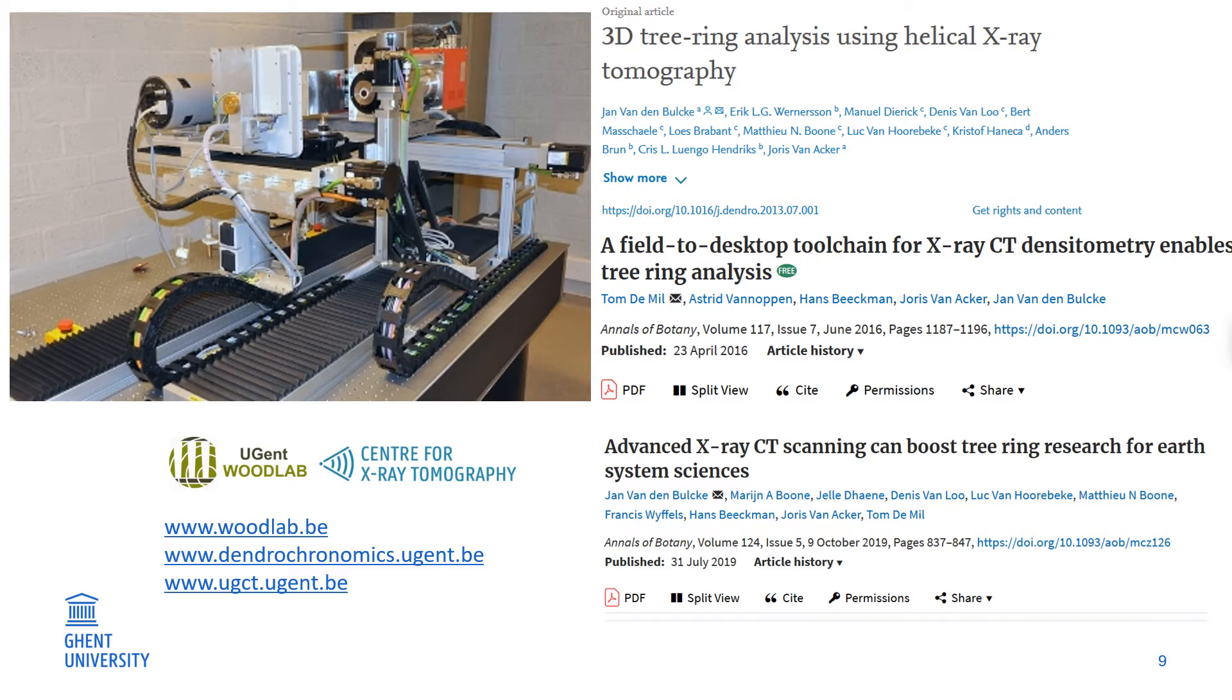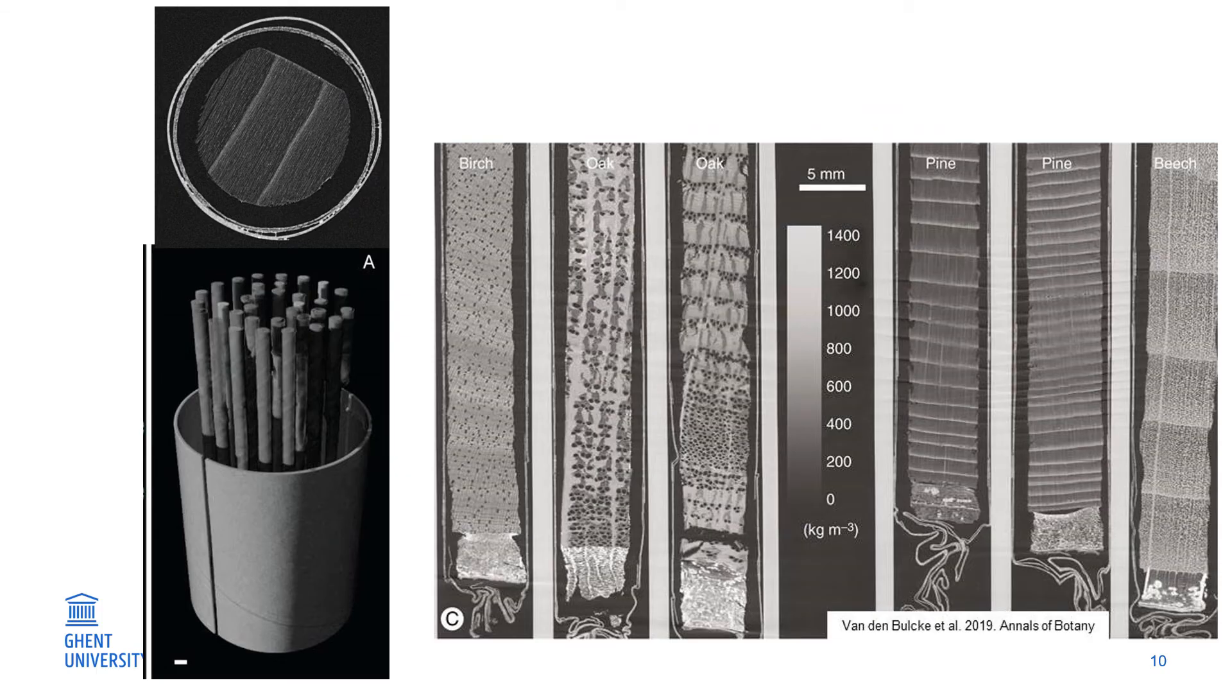This is a legacy of a whole bunch of people that worked on it to optimize scanning tree cores for various purposes—in this case, climate science, but also wood technology and wood anatomy. That's what I want to show here. If we look at our core here, this fits within a sample holder where we can put multiple samples.